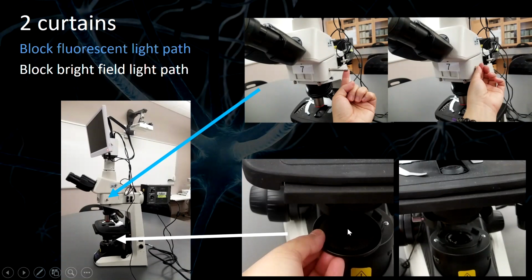If you put the cap on, the light will not be able to go through. At the same time, if you put the cap on, it will also prevent the light from the environment from hitting the lens here and reflecting to your sample. This is the lens that helps us focus the light onto our sample. Underneath this lens, there is a light bulb. So the curtain for bright field is here.